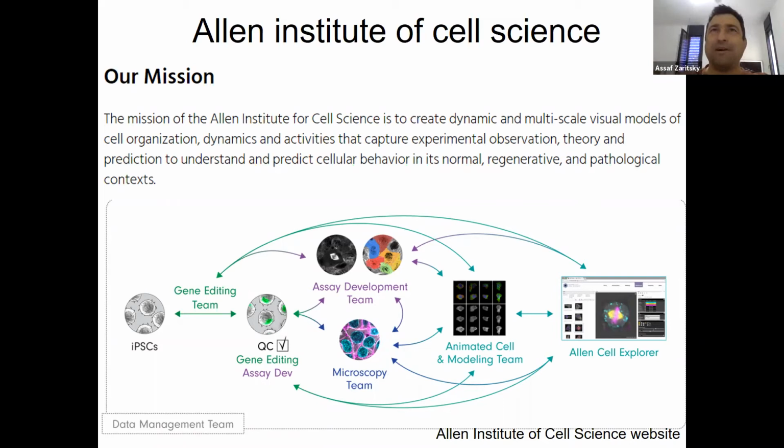So they have a factory-wide setting where they have a farm of microscopes and they are generating cells with specific organelles fluorescently tagged with the best techniques available there. And they give the cells to anyone. So if you now want to take their cells, which are also a cool cell system, but I'm not going to talk about it, and you want to image that in your lab, no problem, they'll send it to you. And they use this farm of microscopes. They are going to validate these cells much better than any individual lab does.